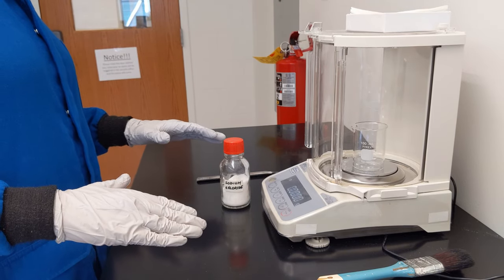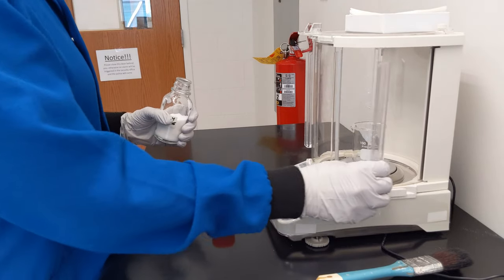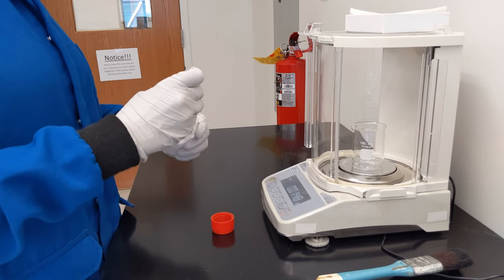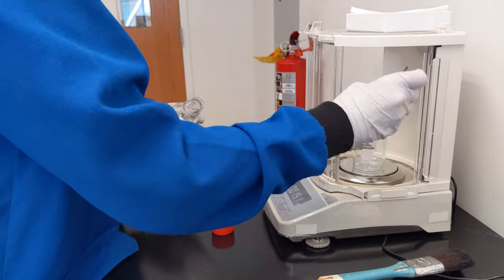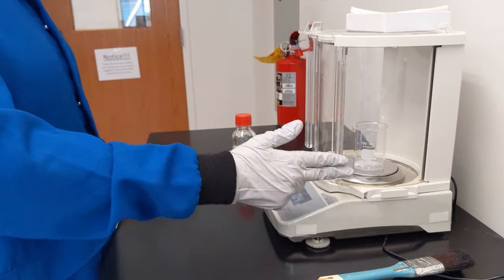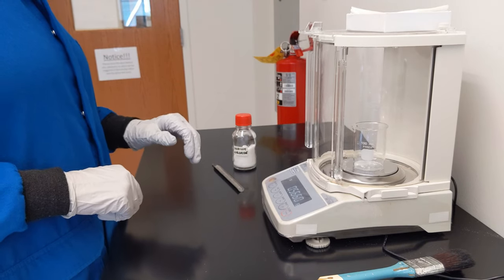I recommend watching it for a few seconds to make sure the numbers aren't changing and dancing around. Now I'm ready to put the sample into the beaker — I need to open the wind guard. When it is open, you are going to see masses that are all over the place because air movement in the room is going to be changing the displayed mass. If I want to record this mass, I need to make sure the wind guard is closed once again, hands and weight off the bench so that my movements aren't affecting it. Then this is the value I want to record: 0.5660 grams.